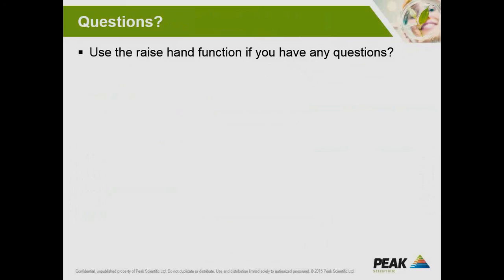Okay. Thanks. So the next question is, do you recommend the use of moisture traps? Are they actually really required? So we would recommend to go with the trap recommendations of the GC manufacturer that you use. Just for example, with Agilent, Agilent would normally recommend for carrier gas moisture and oxygen traps, or you can get a carrier trap. For detectors, we would not normally recommend the use of any traps, and particularly for zero air or makeup gas, it's not normally required to use traps. But for carrier gas, I would definitely err on the side of caution and use traps.